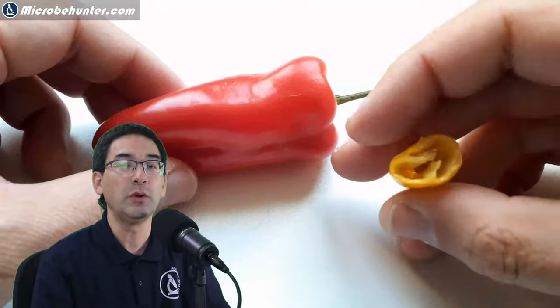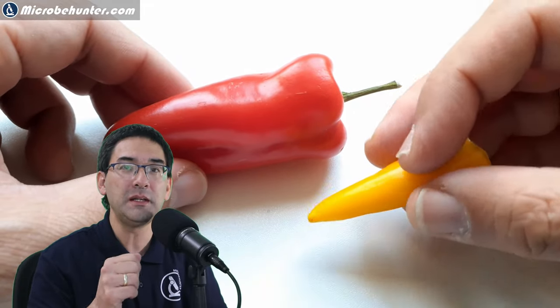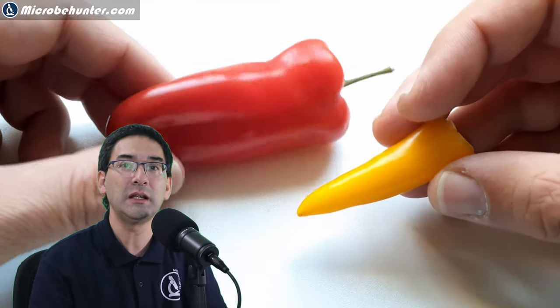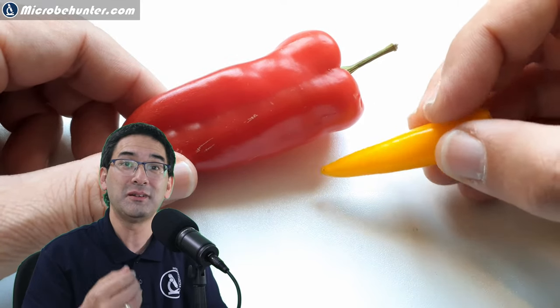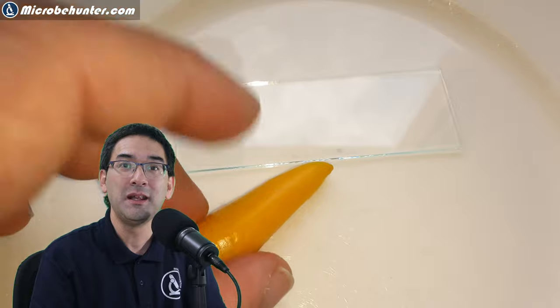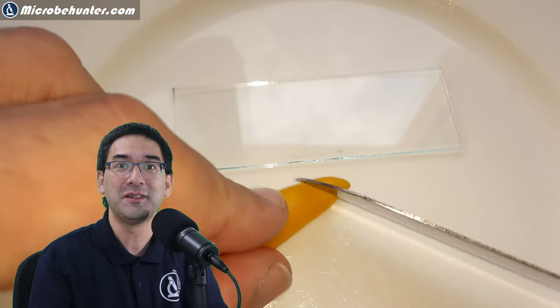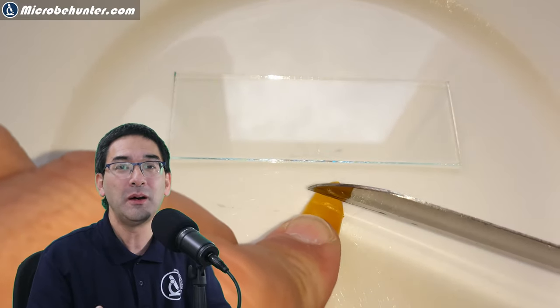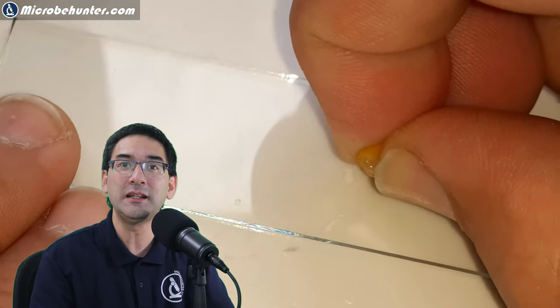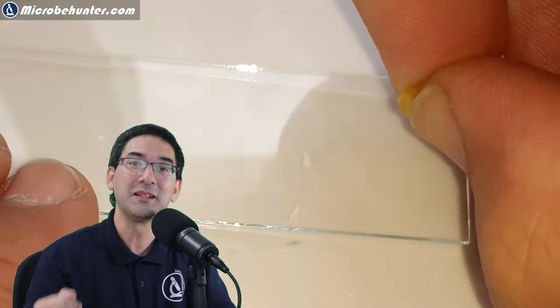Now I'm going to add a little bit of this chili. What I'm doing is cutting off a small piece of the spicy chili and squeezing it very hard to extract the sap — that's the liquid I'll be adding to the paramecia. I squeezed it out first, then didn't directly mix it in yet, but added the substance a little bit later.